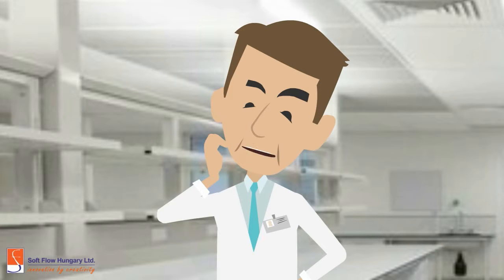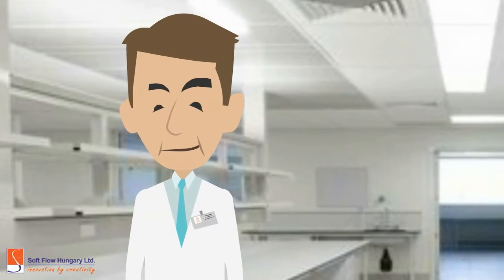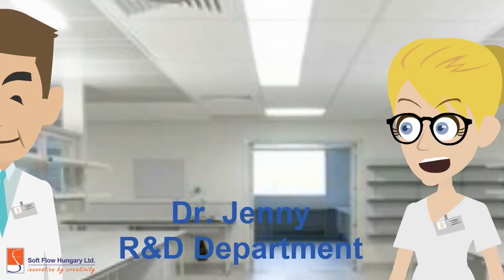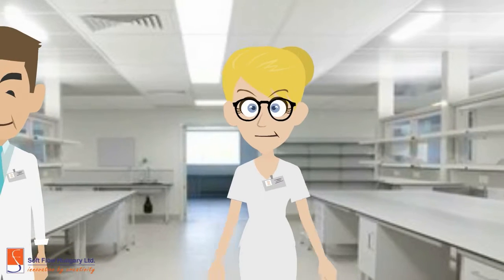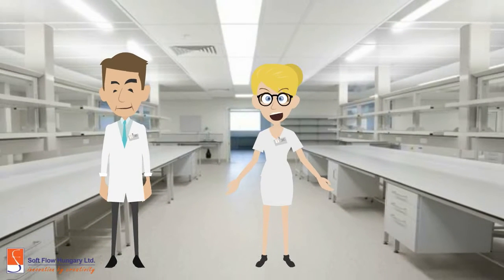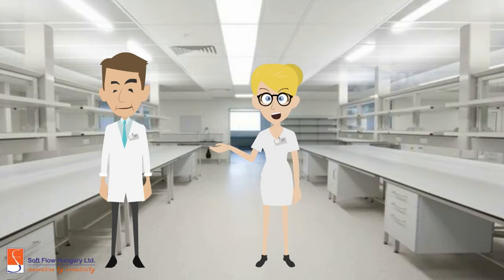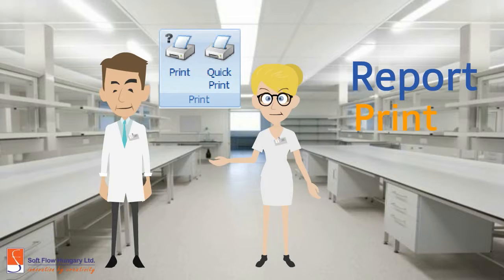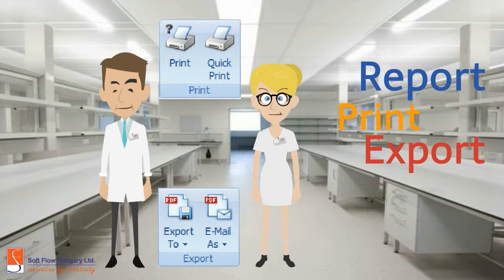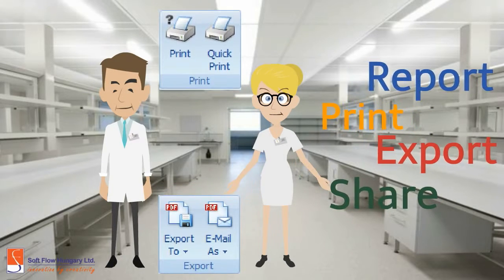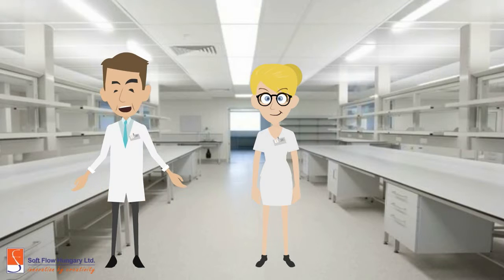Well, I think that's all I need to tell you about FCAP. Excuse me, James. There's a last important step you need to mention. After analyzing and collecting the results for your experiment, you can report it. You are able to print, export to different formats, or even share it as email. Thanks for reminding me, Jenny.